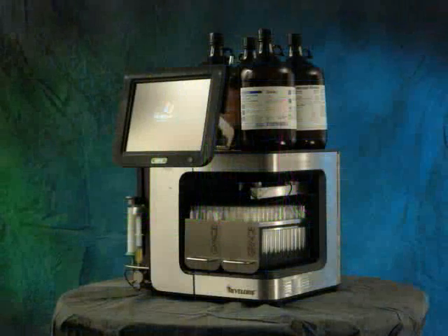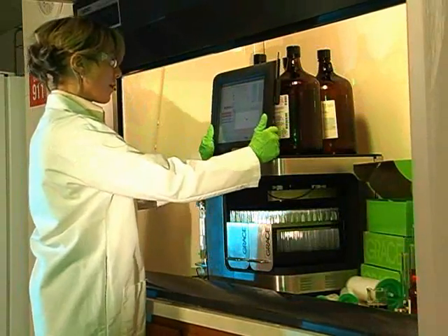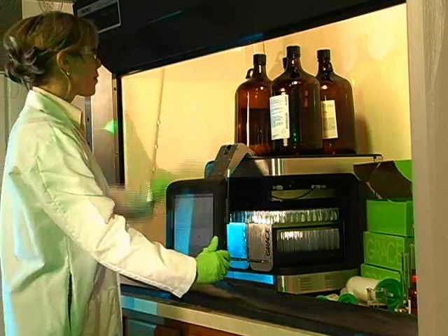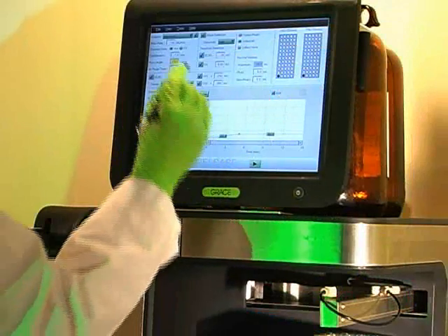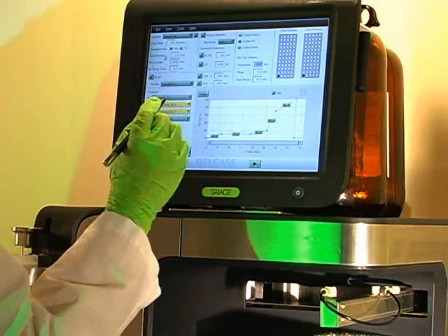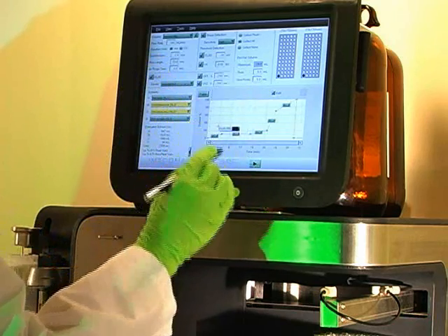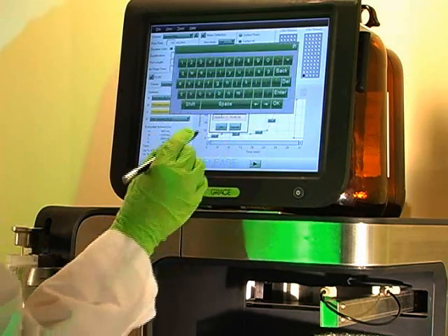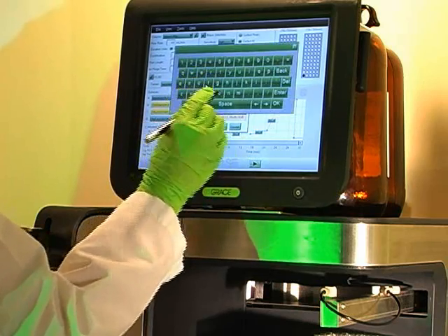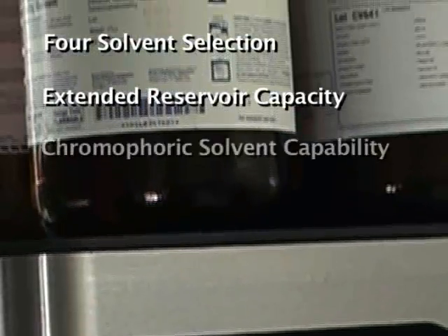The Revolaris system has numerous ergonomic and safety design features. Its small footprint fits easily into a standard fume hood while allowing easy access to solvents and cartridge loading. It also has a fully adjustable display. The interfacing of the Revolaris system is simple, with large single panel touch screen views and easy to navigate control buttons. Pop-up status prompts and alerts help to guide the user. Fraction tracking is managed by a real-time color tray display, making it easy to choose the right fractions for workup. The Revolaris system delivers gradient functionality with 4-solvent selection, extended reservoir capacity, and chromophoric solvent capability.